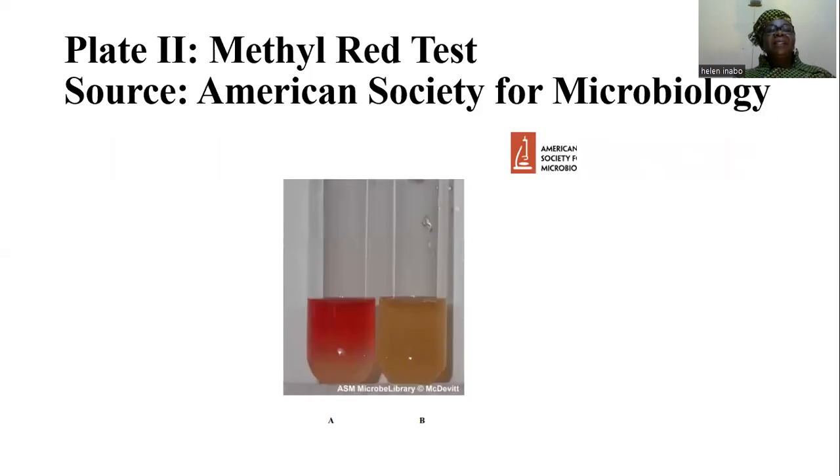Here is a plate showing the methyl red test. This image was obtained from the American Society for Microbiology, ASM MicrobeLibrary. On the left is a tube showing the positive MR test, which E. coli is positive. And on the right is a negative methyl red test.